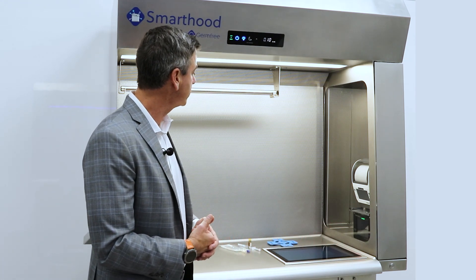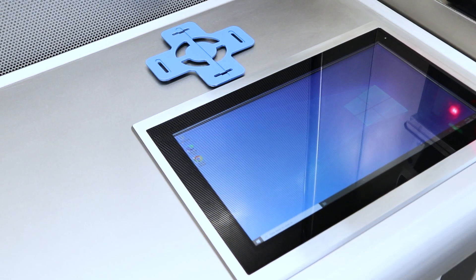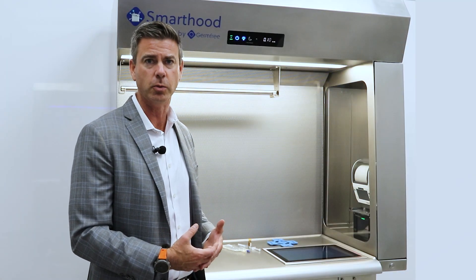So if we take a look at what we actually have here, first thing we have is an IP66 touchscreen that's Windows-based. It allows you to run any Windows application that you want.